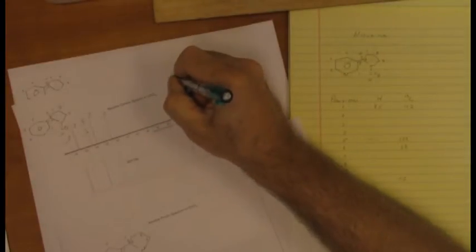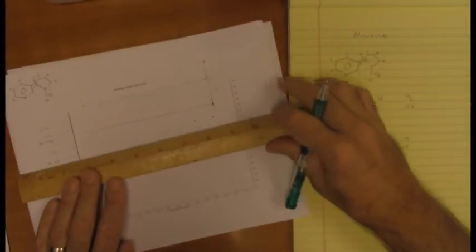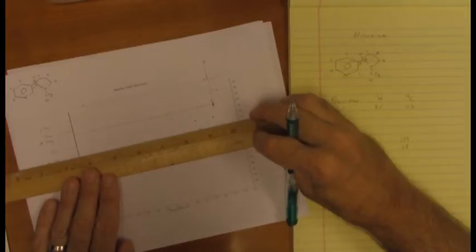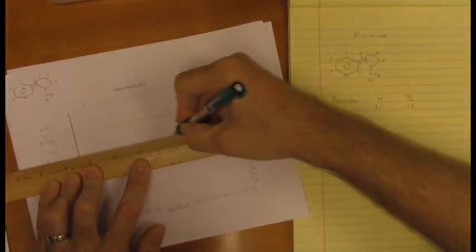Which one of these is position 6? Okay, I know it's carbon. I know which carbon it is. It has to be that one. So this is where our dear friend, the HSQC, plays a powerful role, because if I know that is position 6, then out comes the magic little ruler again, drawing our lovely straight line.